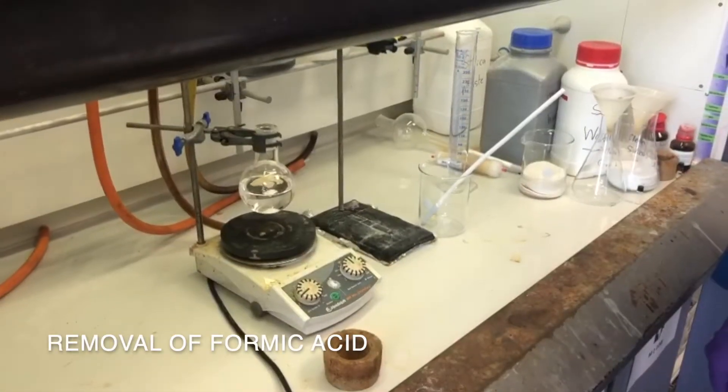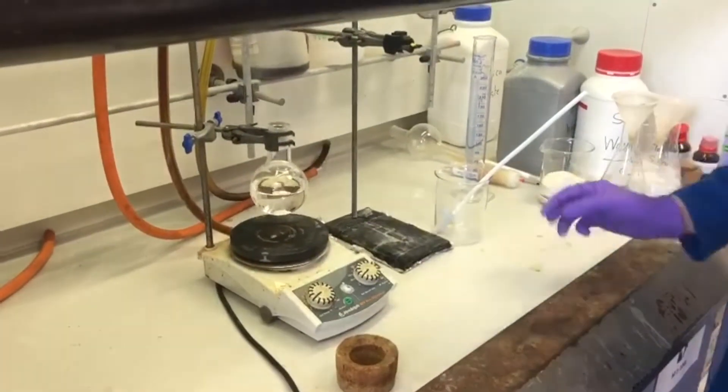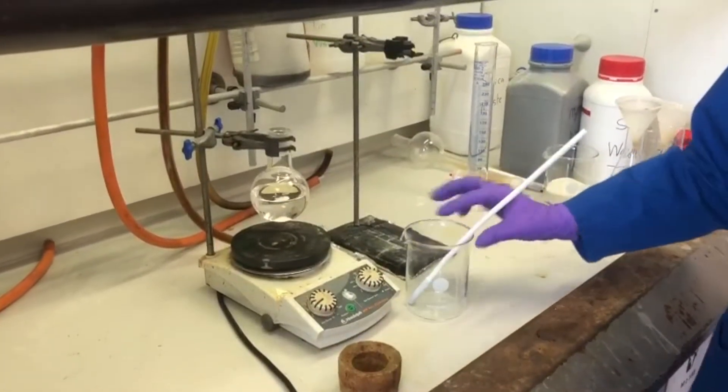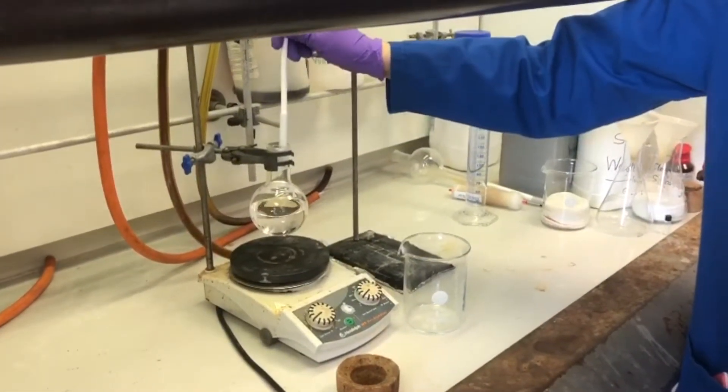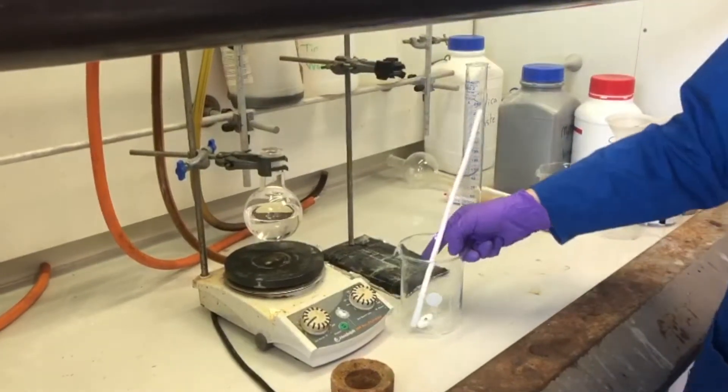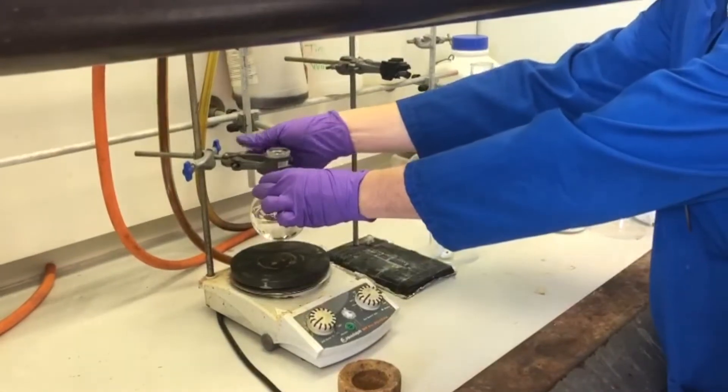Our reaction has now been stirring for an hour, so our dipeptide should be complete. So we're going to remove the stir bar. And we'll take our reaction and remove the formic acid by rotary evaporation.